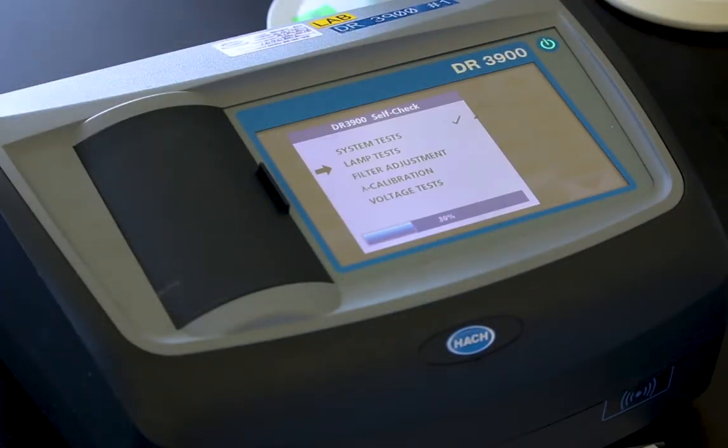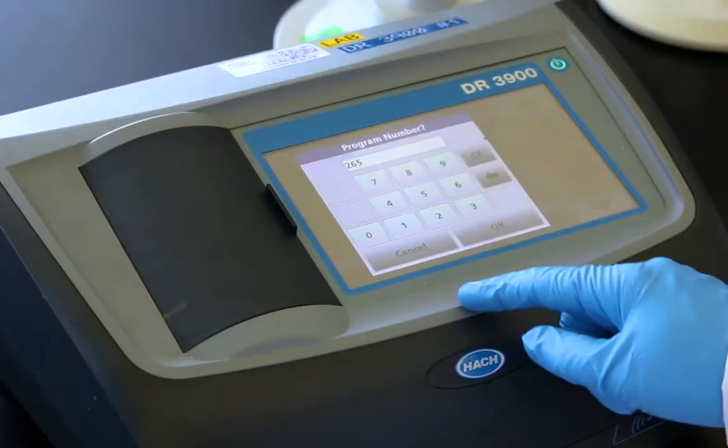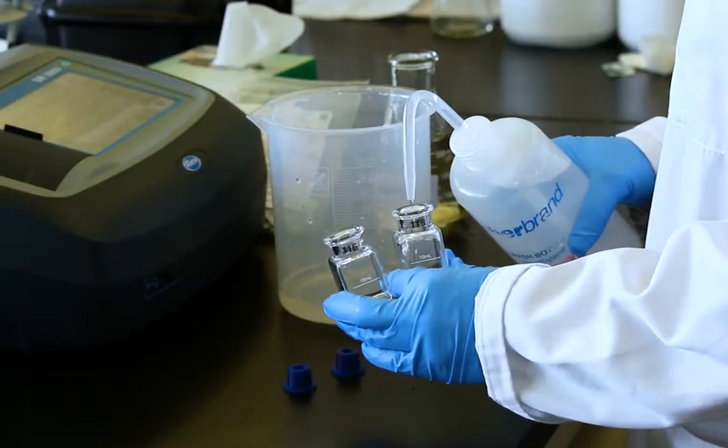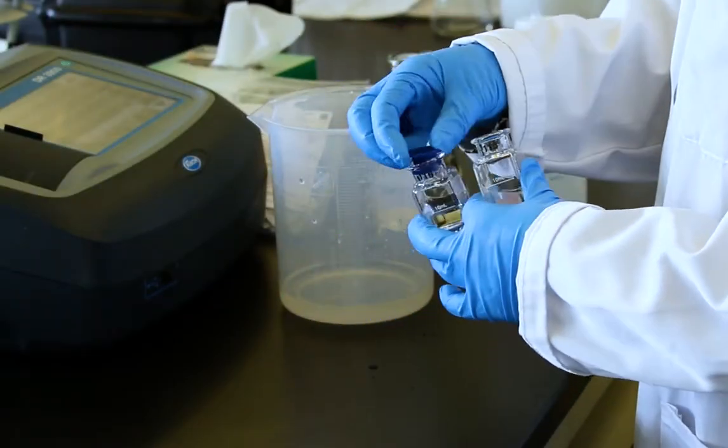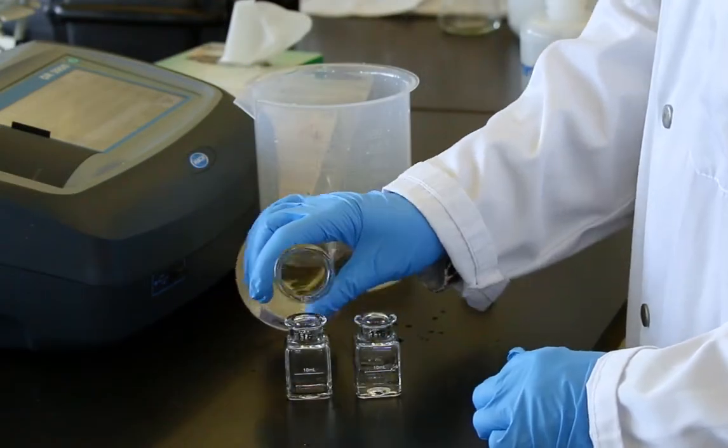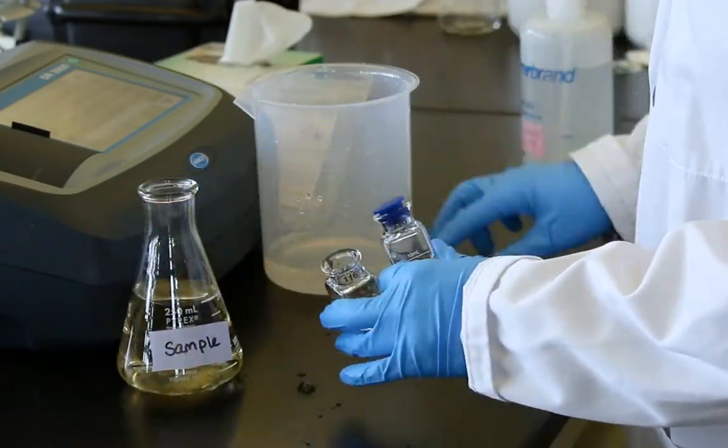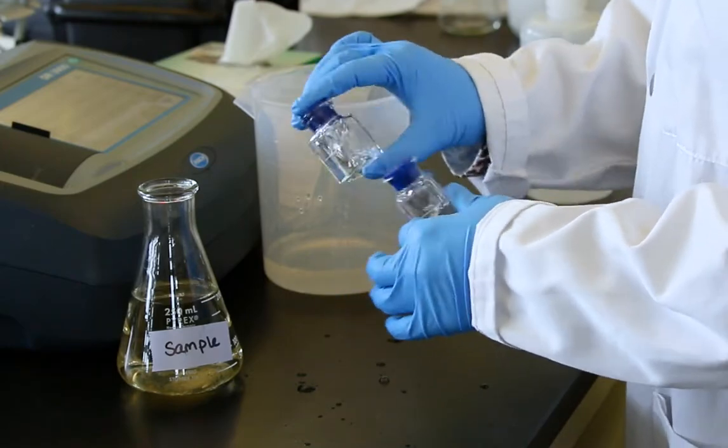Power on the instrument and select the appropriate program. Rinse the set of sample cells with deionized water and condition them with the sample water. Fill the cells to the mark with the sample water.